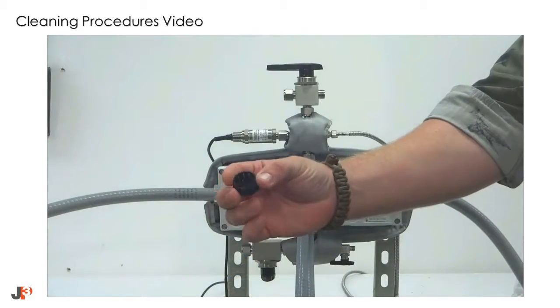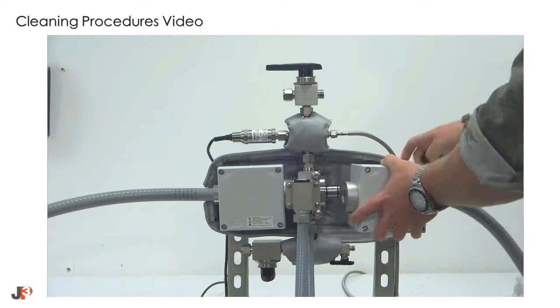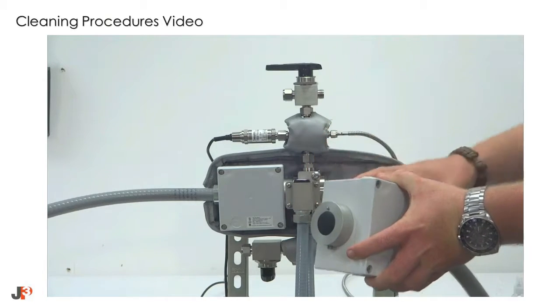Next, remove the collimator mount housing, being cautious not to damage the fiber optic cables. Once removed, install the protective dust cap to prevent debris from entering the housing.